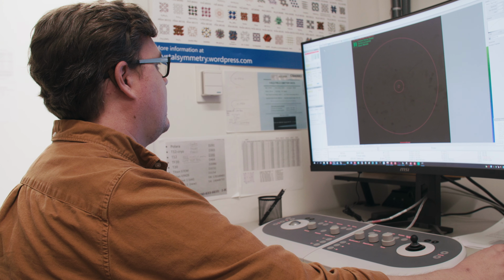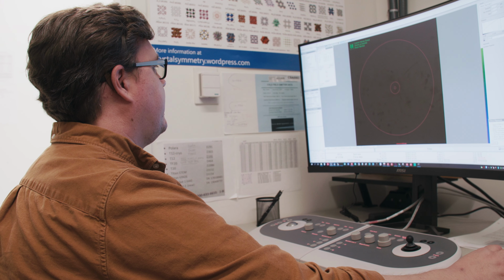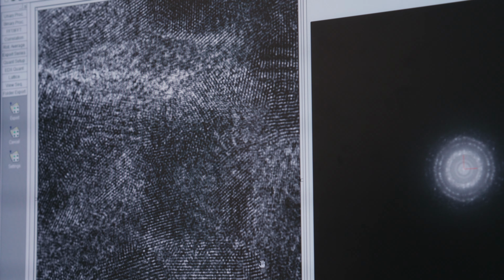Biological structures are bound by chemical bonds that are very sensitive to the beta radiation produced in an electron microscope. We can make several copies of these beam-sensitive biological structures to spread out the radiation damage. By imaging nearly 1,000,000 replicas, we can average them together and produce a single structure with atomic resolution. But there's a problem. If our structures have fewer than about 10,000 atoms, it becomes hard to differentiate them from the background of the support. We need another method to directly image.